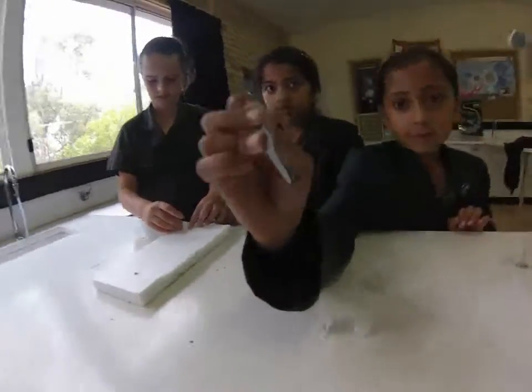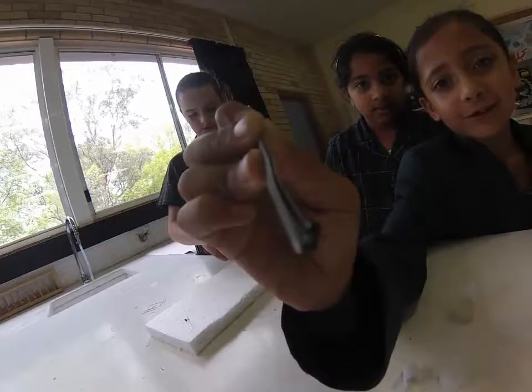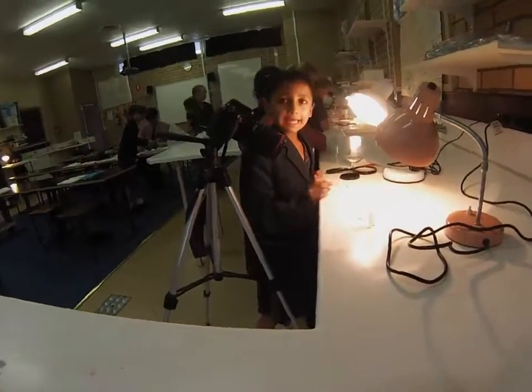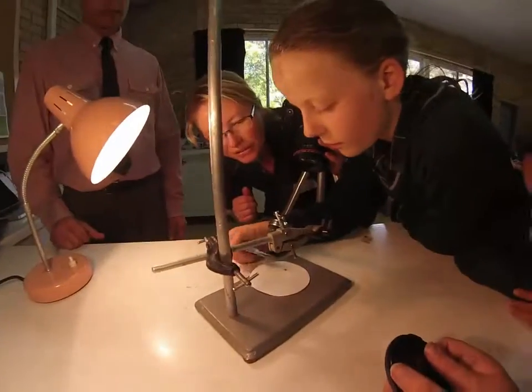What are you doing? Are you pinning? This is an ant that I took out. It flipped over again.